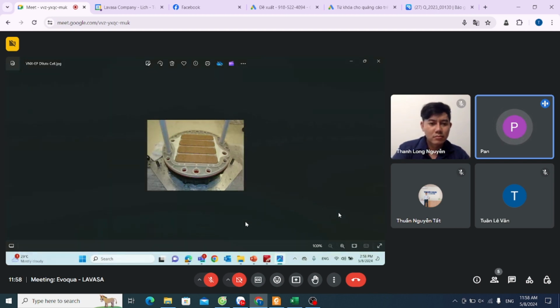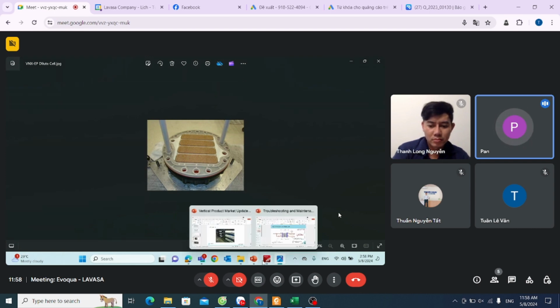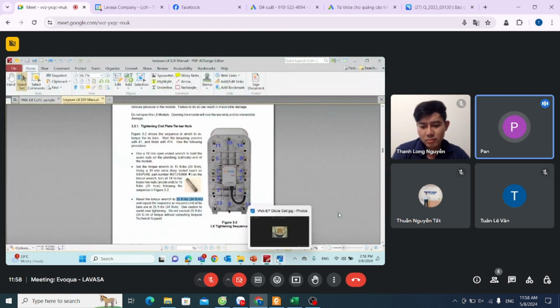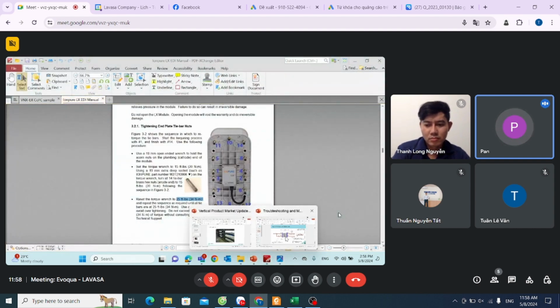Then if the resin comes onto the O-ring and leaks, and you try to tighten again, there is resin on the O-ring and it doesn't work. That is because the resin is already on the O-ring. So always make sure before you run, tighten it, and then you run. I think this one is very, very clear. I think that's about it.